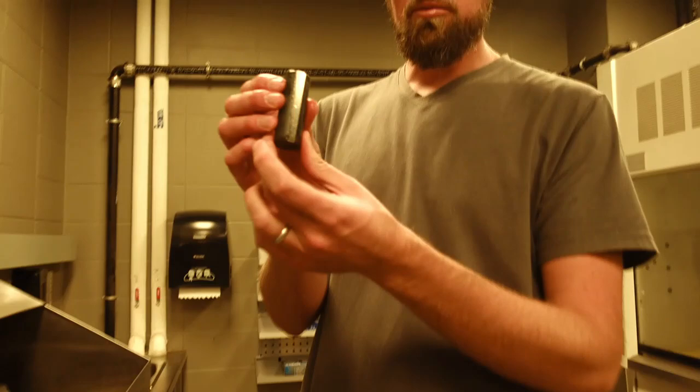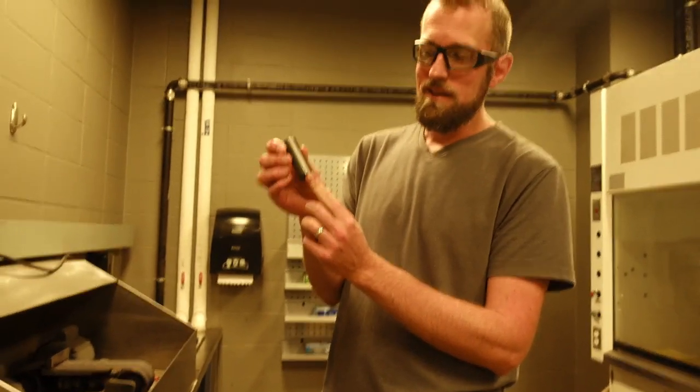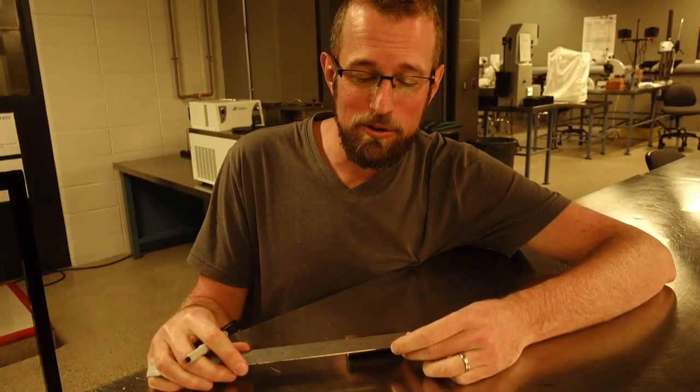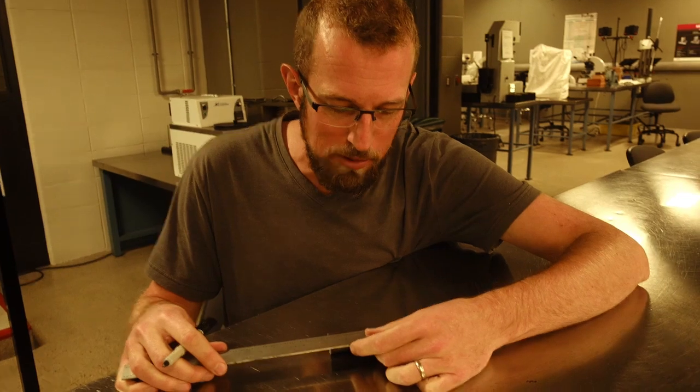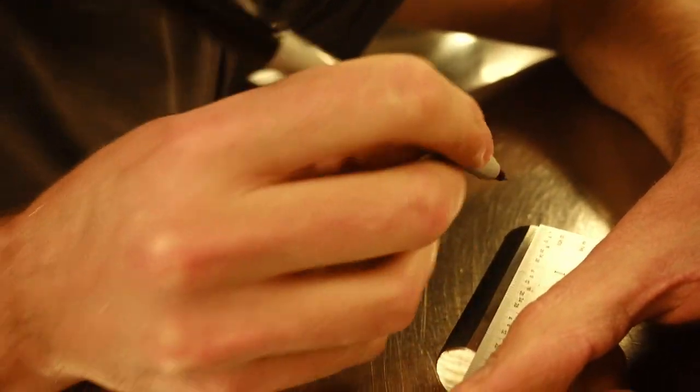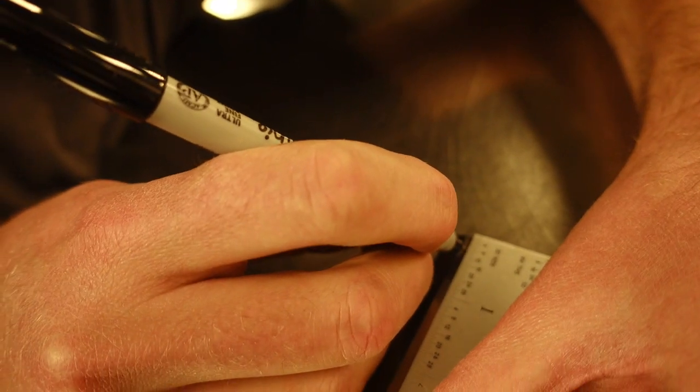So we've ground one surface down flat here. We'll be testing from the quenched end and doing a series of hardness indents along that flat portion there. So there's a standard for Jominy testing, ASTM A255. And according to that standard, we're going to test hardness every sixteenth of an inch for the first inch, and then slightly more spaced out after that. So all I'm doing here is just marking those individual points.